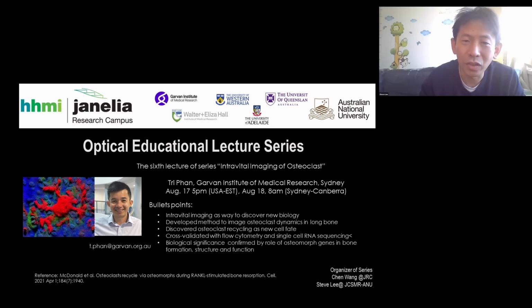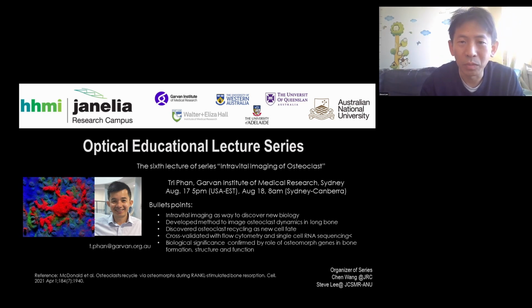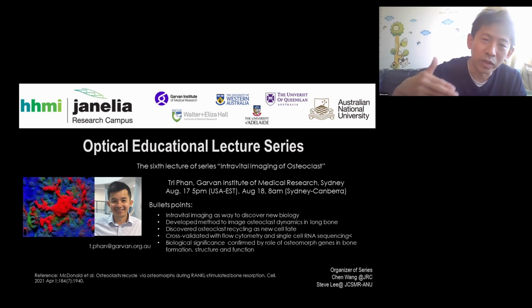On top of that, at least in the lab, we've been playing with a lot of cylindrical capillary tubes to try and mimic those very large curvatures, and we have been able to correct for up to 80%, recovering a lot. So we're using that model to try and predict what sort of aberration we'll get when we get to the experiment in vivo.